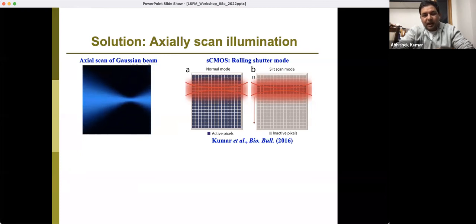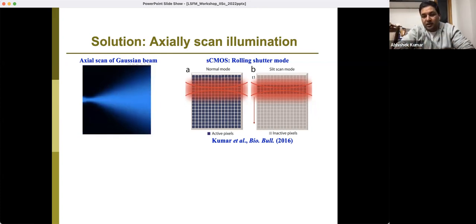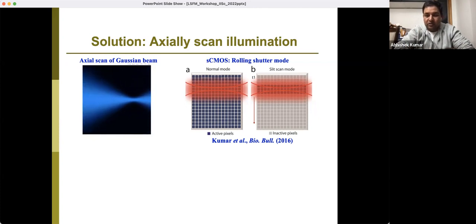I would also urge you all to read a little more about sCMOS cameras and understand them, because that will help you understand the different configurations people have implemented. We are really utilizing some of the flexibility sCMOS cameras and their control electronics provide us. Now it's hard to get a good EMCCD, because all camera manufacturers are imposing that we should buy sCMOS.